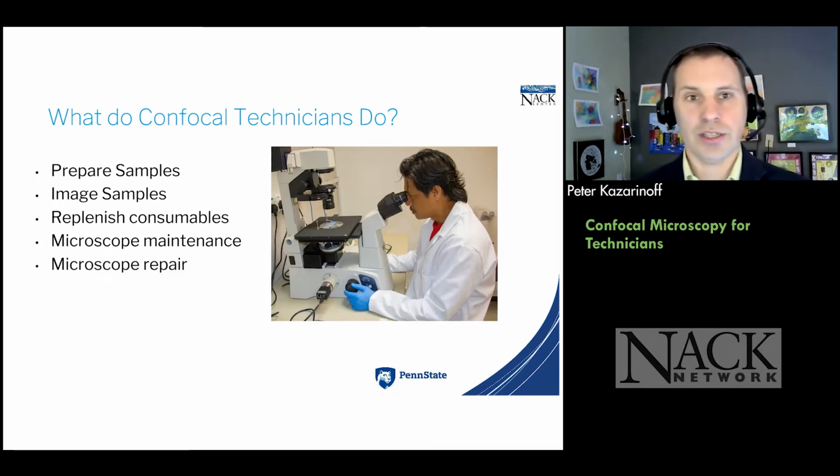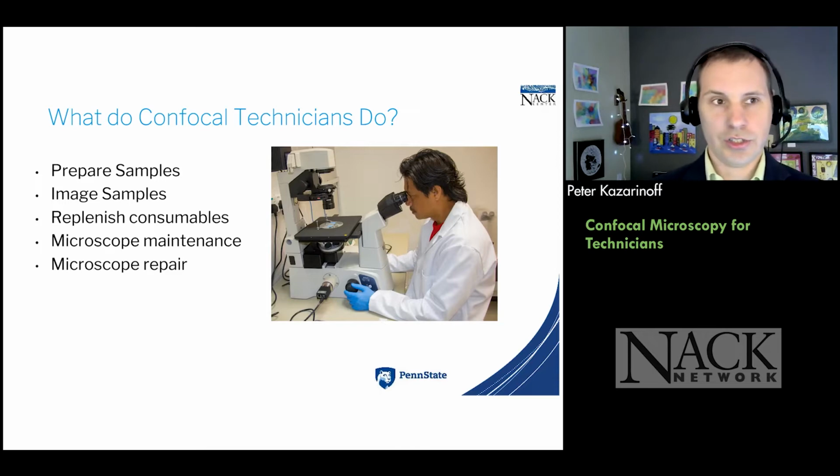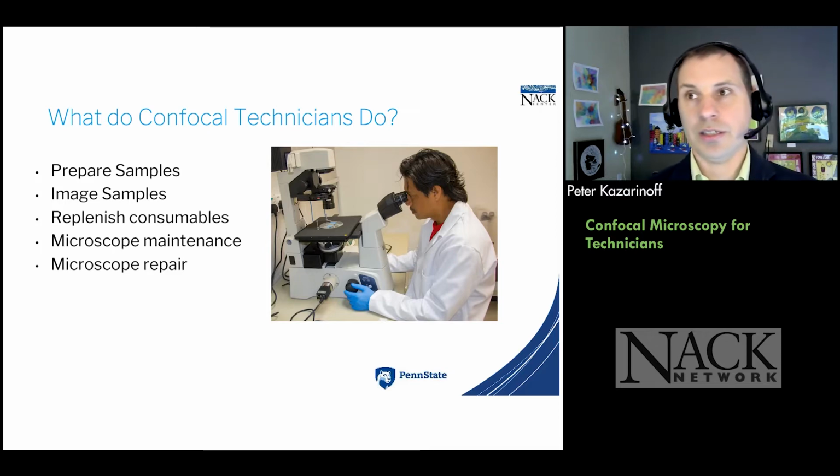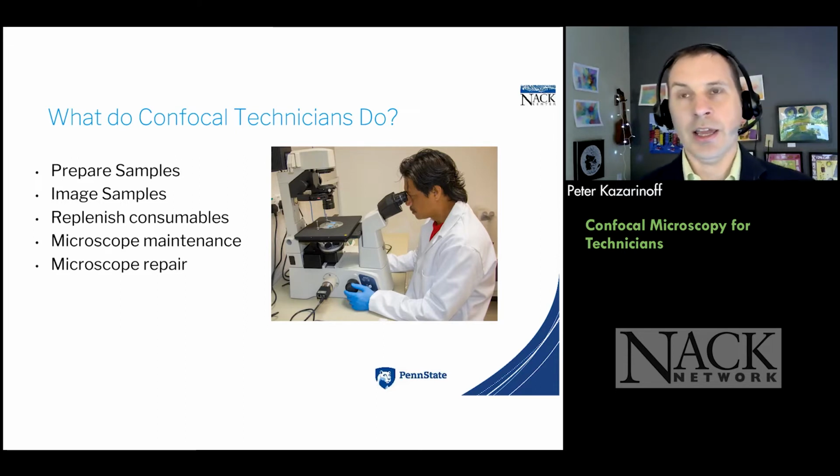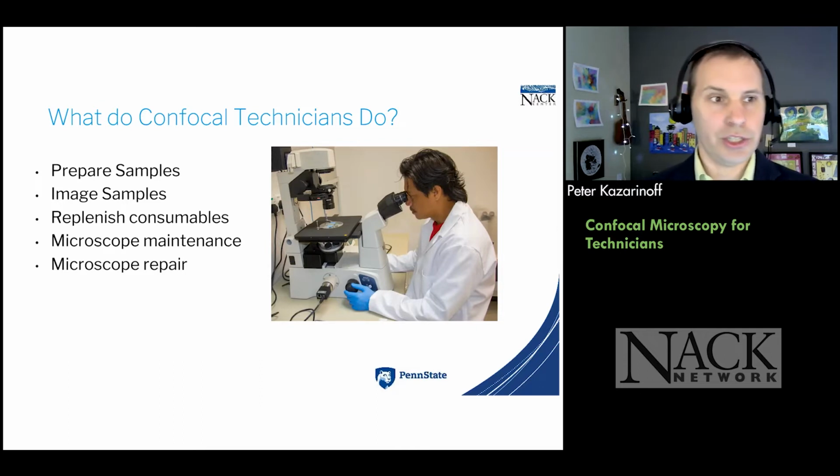So what did we train these technicians to do with confocals? Well, the sample preparation for confocal microscopy is quite different than it is for SEMs or TEMs. We had to instruct students on how to prepare slides, how to use cover slips, how to use fixatives, and how to use sample dishes.